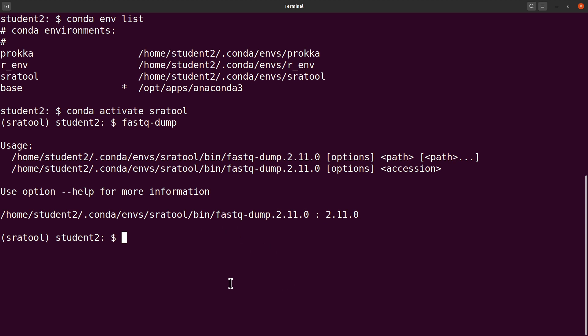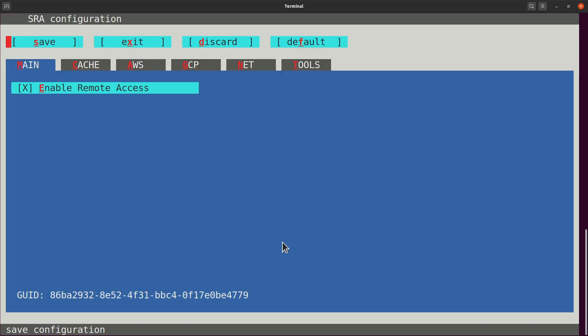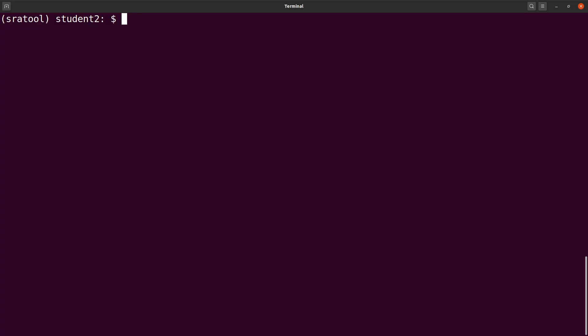To do the configurations, you can say vdb-config --interactive. That's the configuration. Once you just have to open it once, and then you just exit. You can use the tab key to navigate or press the escape key to exit this interface. Once you have done that, you can now run your SRA tool kit.